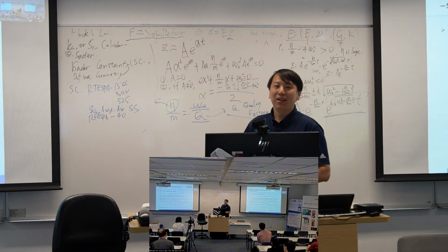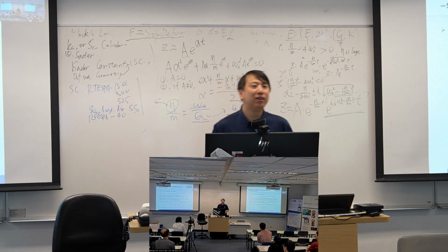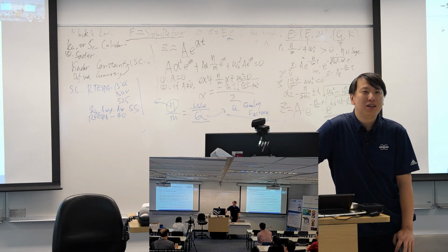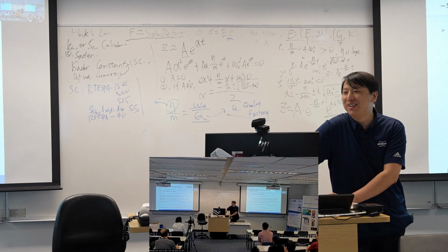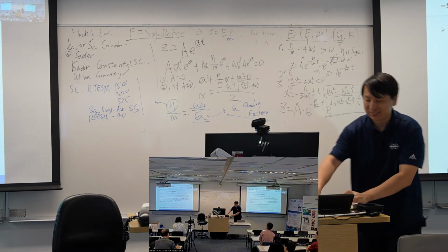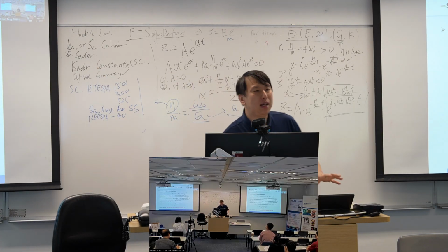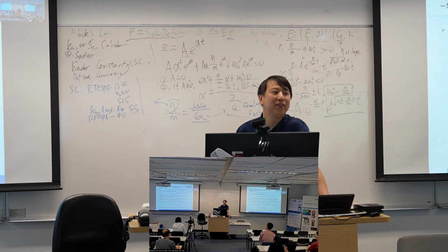So if you are using the probes of these 5, you can find the Sader constant in the software. We can show you this afternoon. But if you are using other probes, I'm sorry, Bruker, we have to go back to our applications. But if you search online, Professor Sader has established his library widely, not just Bruker's probes.